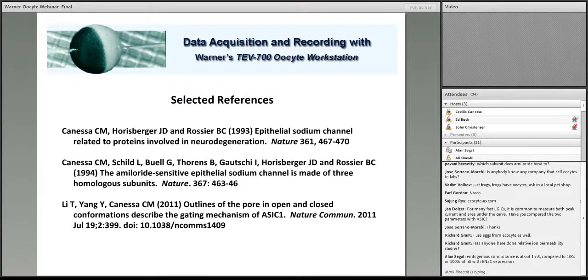Ion channels are minimal. There are a few that can be opened with certain maneuvers. For instance, if you remove calcium from the bath, you can open some connexins that will generate an inward current. But the calcium concentration to activate such endogenous connexins has to be very, very low, in the micromolar range. So it's good to know that.